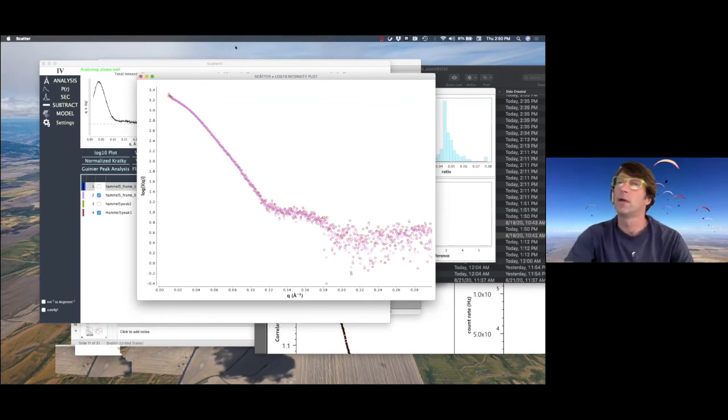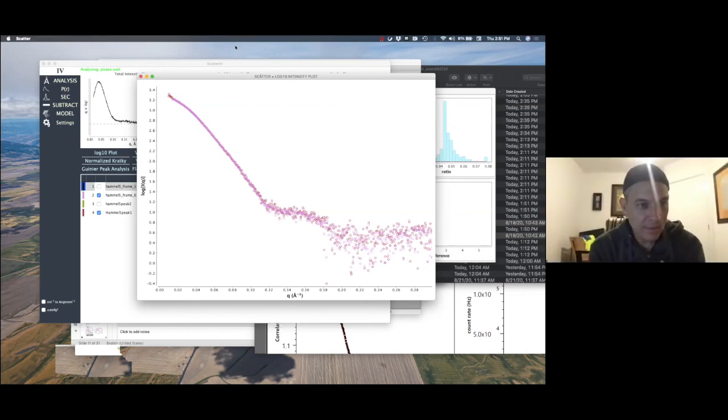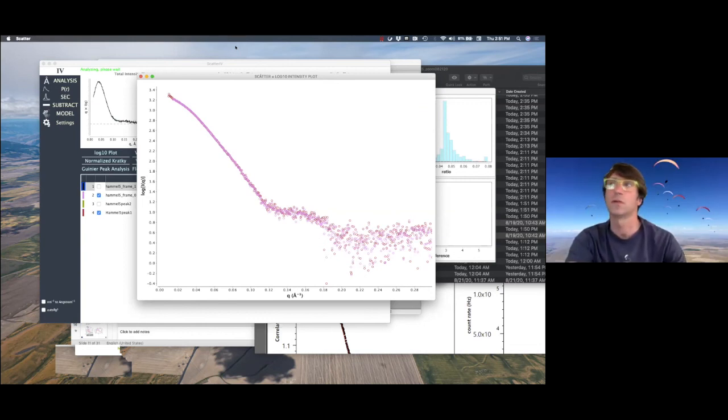Our beam is not focused on a very small spot, and so we try to preserve the sample and not aggregate it, let's say not burn the sample in a short time. How big is the beam? We still have about 1 millimeter to 0.2, 0.3 millimeter. It's more than 1 millimeter, but 2 to 1 millimeter.